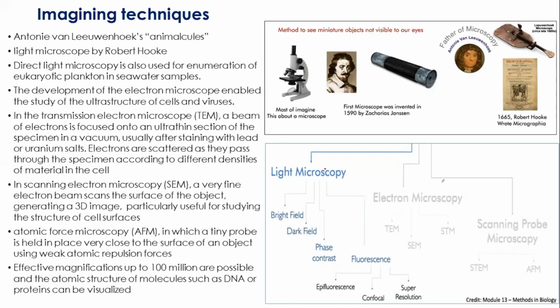So it means whenever we think of taking any image, we think of the microscope, and the most common one we think of is this. However, we know that the microscope was initially in this form, a single tube kind of structure, right? And then we know that most of the marine microorganism study started after Antony van Leeuwenhoek using his lenses, right? But now we know that there are plenty of different imaging techniques.